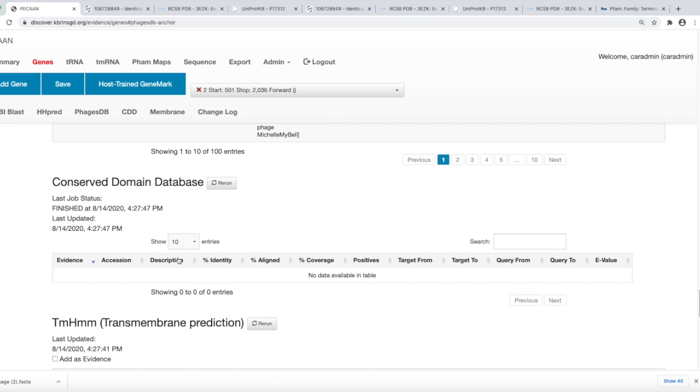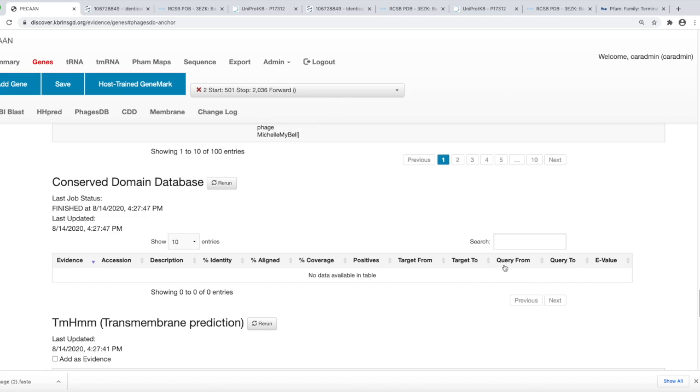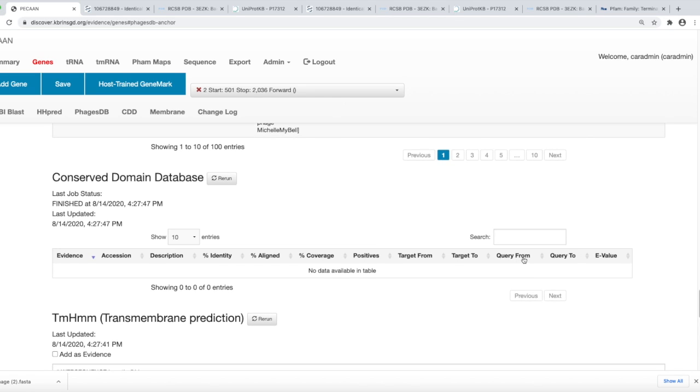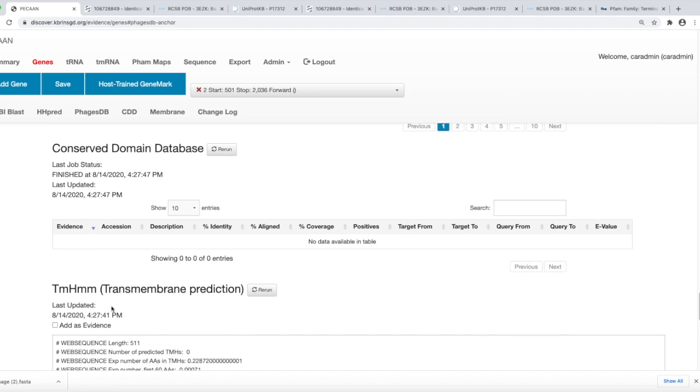Also, in the conserved domain database, you can oftentimes mark more than one because there may be, as we just looked at, a single-stranded binding protein, ATPase, nuclease function. If you found hits to those domains, you may find all of them. So you may want to mark more than one. How you can determine that is look, follow, as you scroll down through, look at the query from two range and see if you get different ranges. If you get different ranges than two functions, then you can mark the different functions.